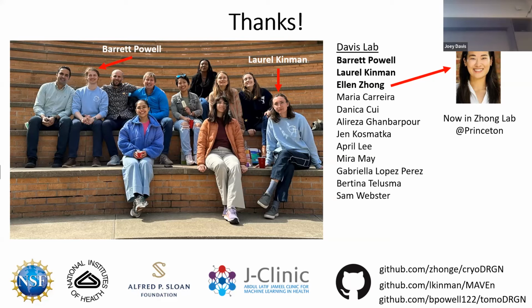and that's really the limit. There, you're adding on the order of 600 daltons of mass with each base pair that you add. I would say we're pretty good at 3 base pair deltas, so there you're on the order of 1,800 daltons. We're less good with 1 base pair deltas, so it's somewhere in that range of a kilodalton mass. As the detectors get better and as these algorithms get better, that's when you get pushed lower and lower.